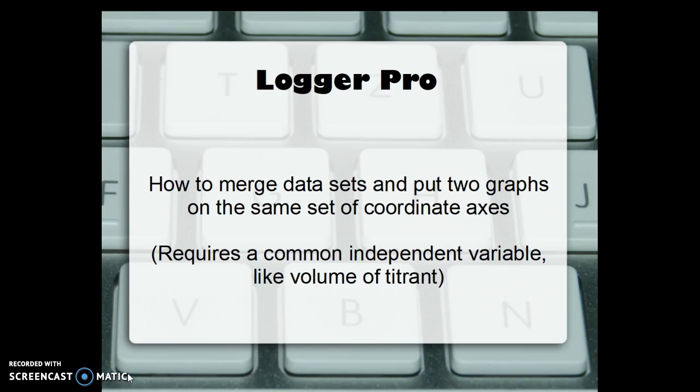If you're doing this with two different independent variables, you really can't do this on LoggerPro, or, I can tell, any other program.